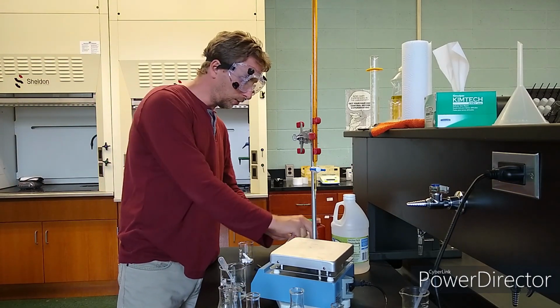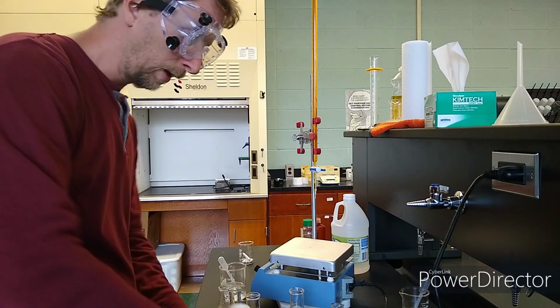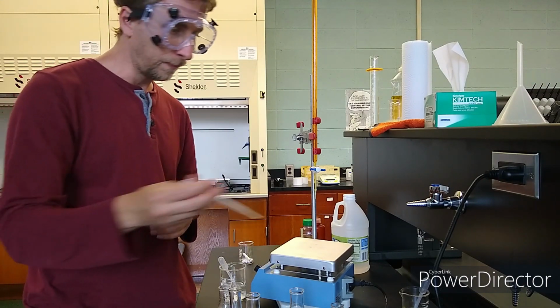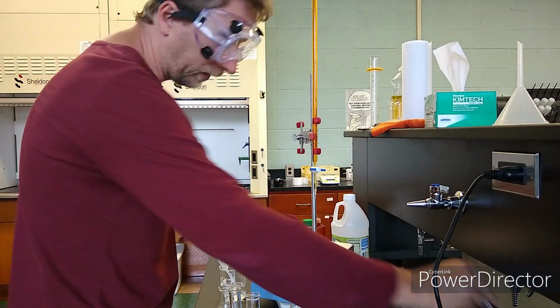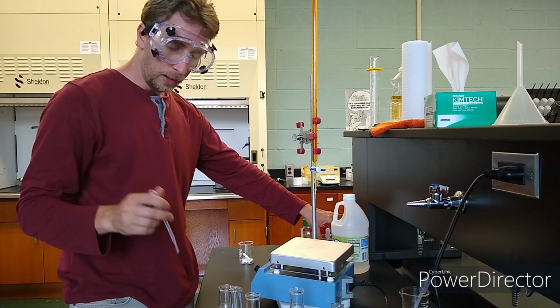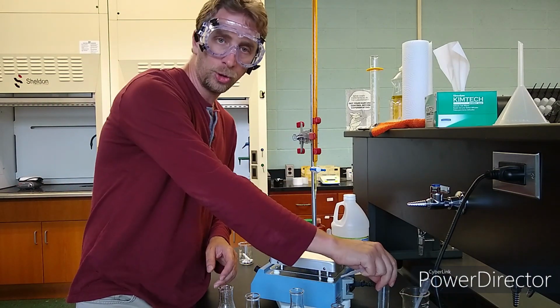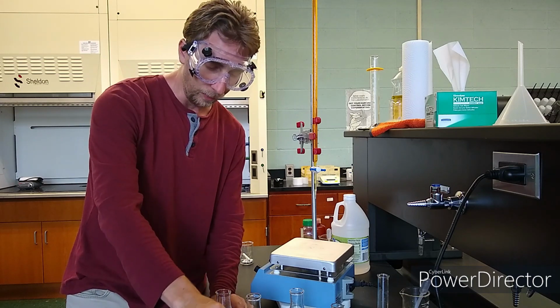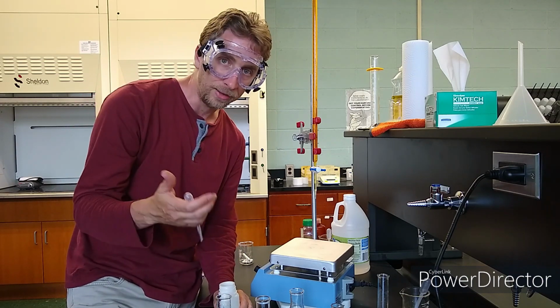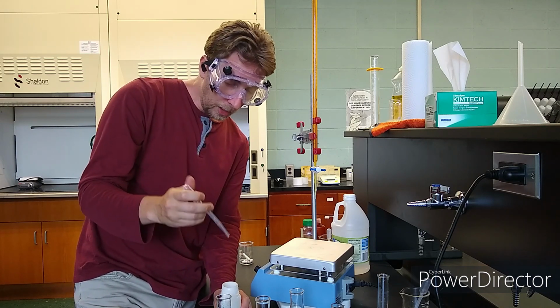Next up, let's do the starch. 1% starch. And it says 3 milliliters of starch. Now, you definitely don't need to know the starch precisely with its volume. So all you need is a consistent amount and enough to see the purple color, which doesn't take much at all to see the purple color because it's a very, very dark purple color. That's why it's a good indicator. The starch is a good indicator for the iodine.